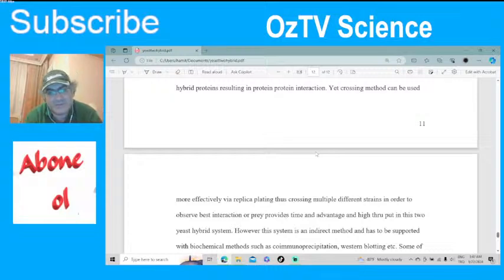It provides time and advantage, depending on your lab. So replica plating is like, you have a master plate, and you use the master plate as a stamp, and then you use velvet fabric, and then you can make many copies of the master plate with the velvet.